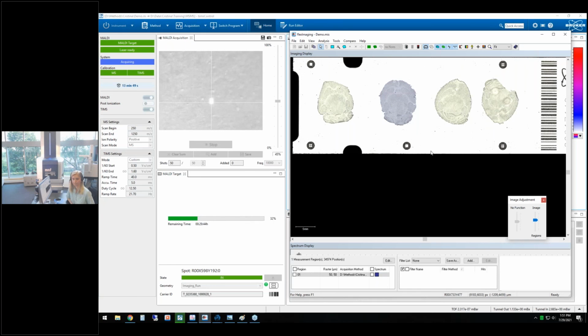From another acquisition question, is it possible to do both positive and negative images from the same specimen? We can do that, yeah. So right now, as you can see, we are acquiring in positive ion mode. When I'm done, I'm almost sure I'm going to have sufficient matrix left behind on the tissue. You see, I'm acquiring only 50 laser shots per pixel.